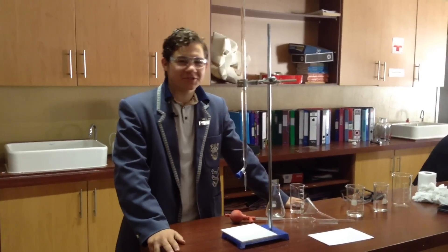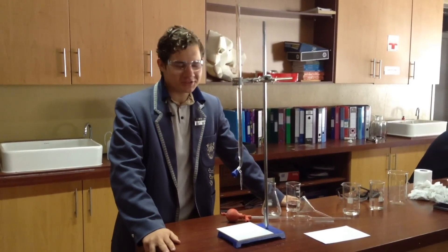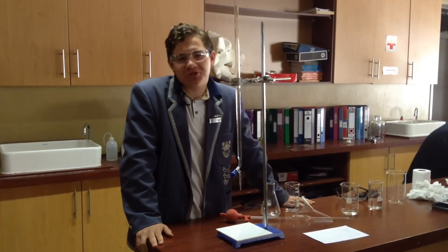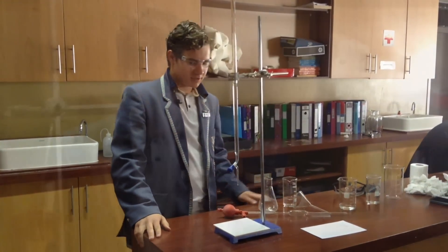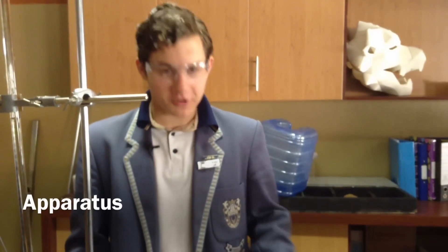Okay, so today I'm going to be showing you guys how to do a titration. A titration is used to calculate the concentration of an unknown substance.